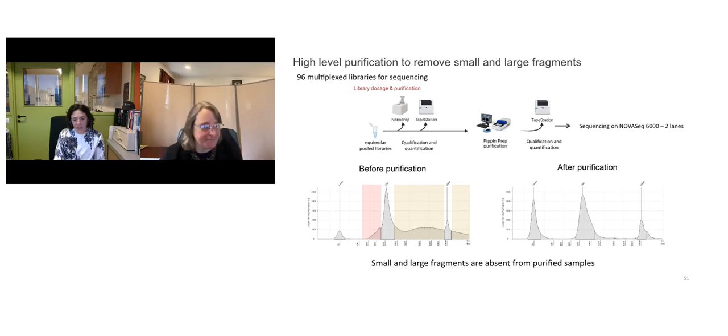Yes, so just to follow up on what Nina nicely showed, this index hopping is something that is definitely tiring when you are doing sequencing and want to analyze many samples at a time. It's also a question of money, so you need to find the balance between the number of samples, the quality of your samples, and the cost of this sequencing.